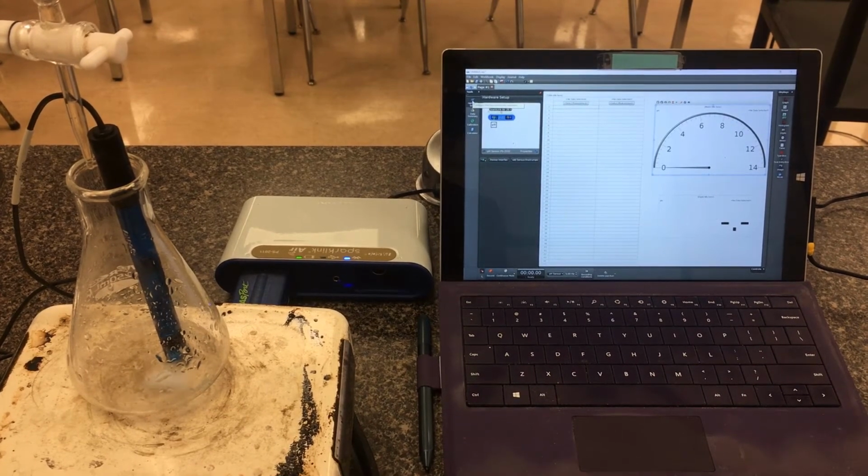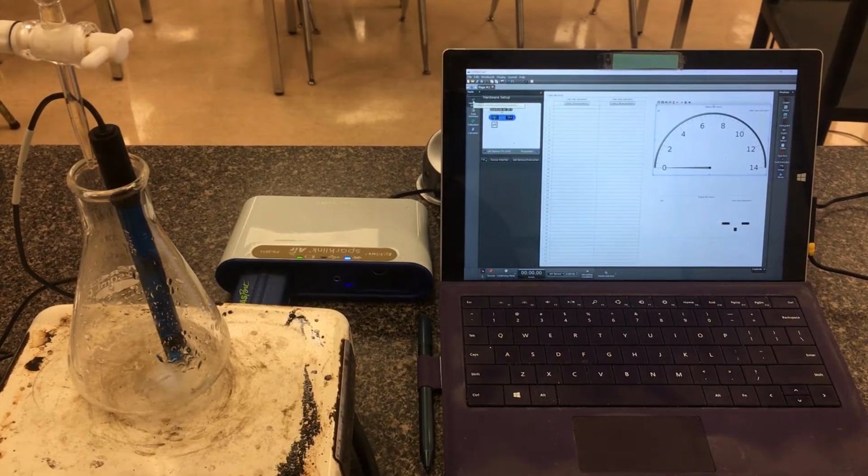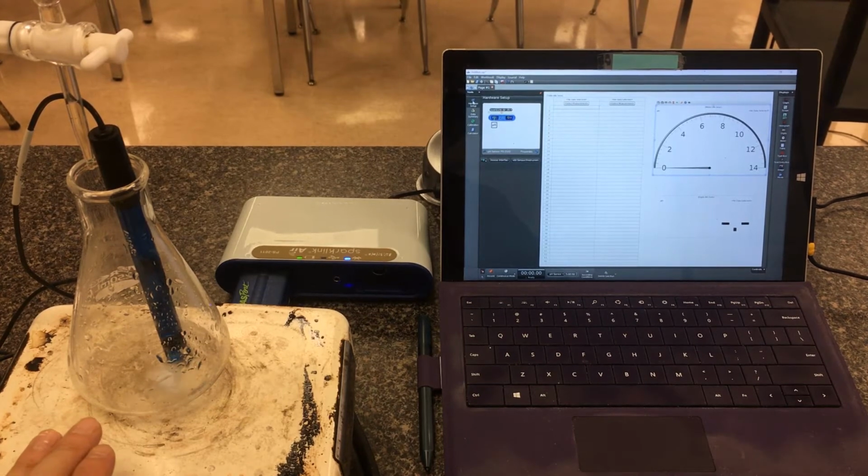Okay, so I've reset the titration here. I've topped up our burette. Right now we're at the 0 milliliter marking. The solution is 0.100 molar sodium hydroxide. We're still going to be dropping the base here into our unknown acid. This was freshly pipetted here, 10 milliliters of some unknown HCl.